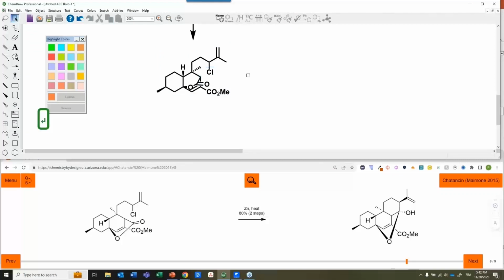I don't really have a proper trick for that. Pressing 0 here to close the ring, and pressing O, pressing H, and here that would say manually change things.